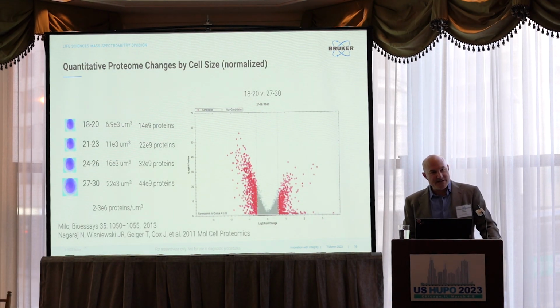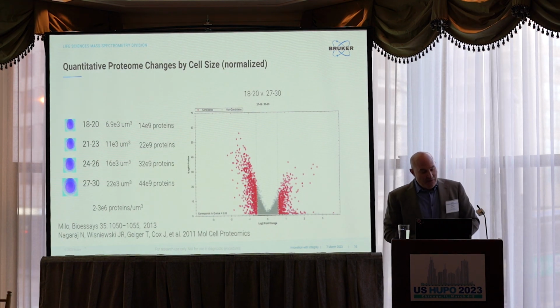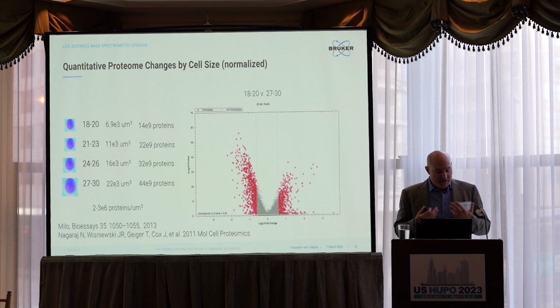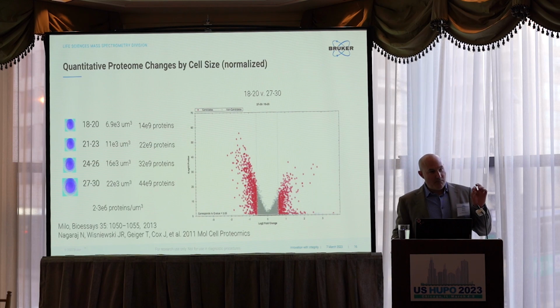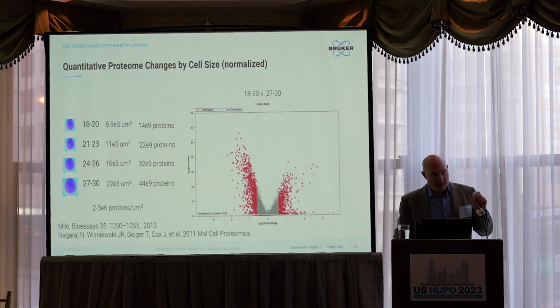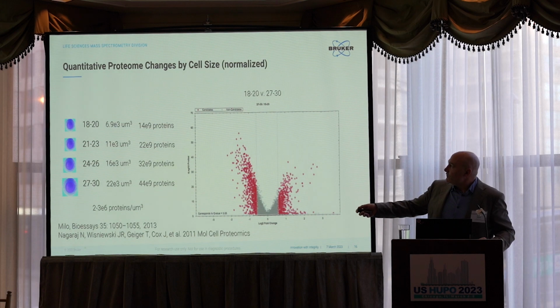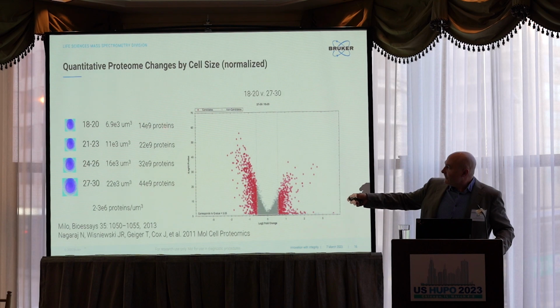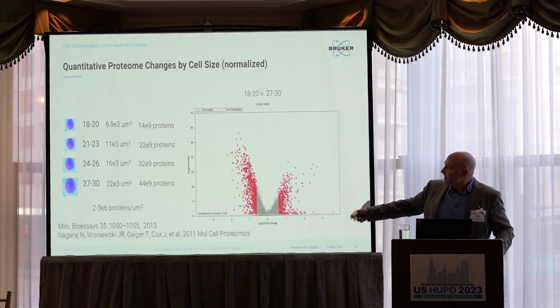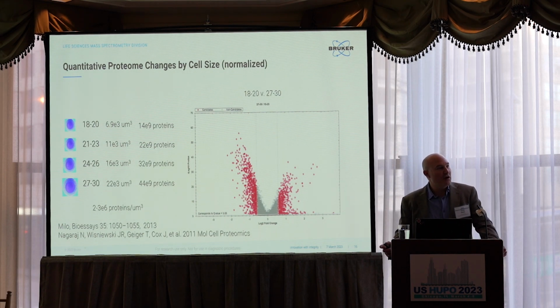And it's interesting, I did some math last night and maybe the day before. And what I found, I actually didn't know this at all, but looking at some of these papers, it's assumed that per cubic micrometer of cell, there's on average 2 to 3 e to the 6 proteins, right? So you can calculate the volume quite easily of each of these cells, and you'll see even from the smallest to the largest cells, it's 3 times more protein that you could potentially see.